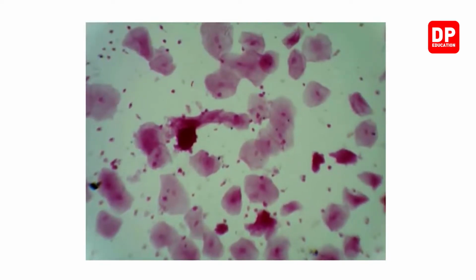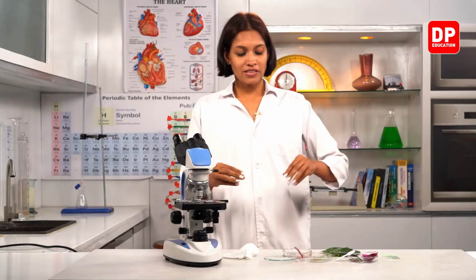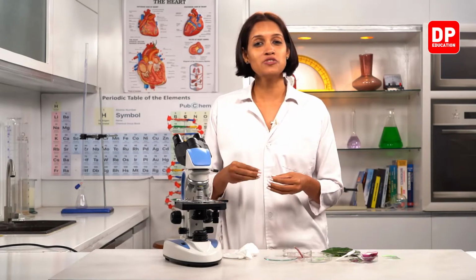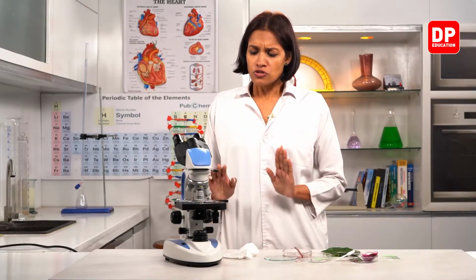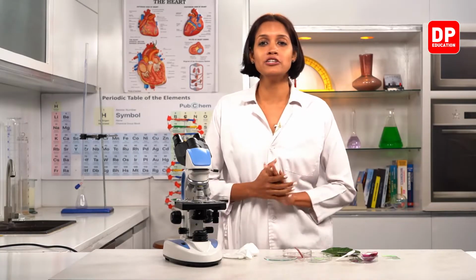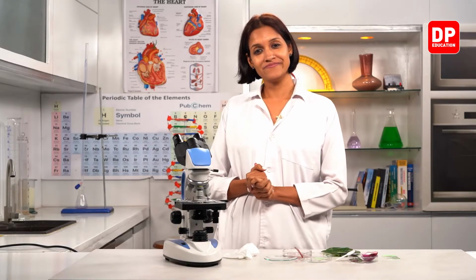So they look purple in color. Because now here you can see the cheek cells purple in color because when the slide is made, it is stained, which means colors are added for easy observation. Right, children? So we observed 4 different types of tissues, plant and animal tissues, 3 plant tissues and 1 animal tissue. So I hope this part was clear.